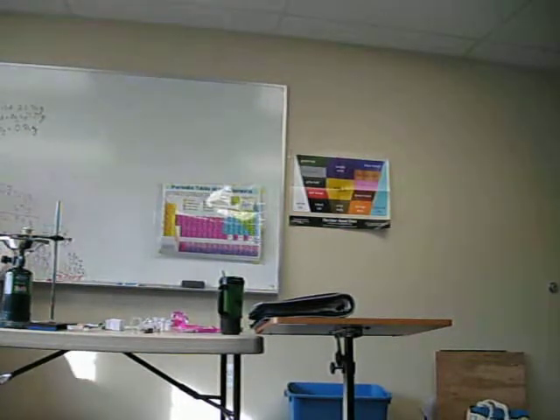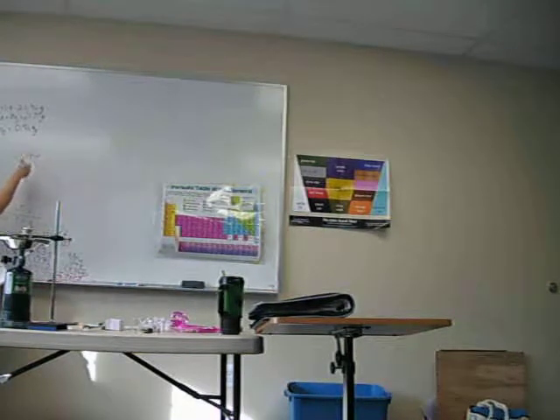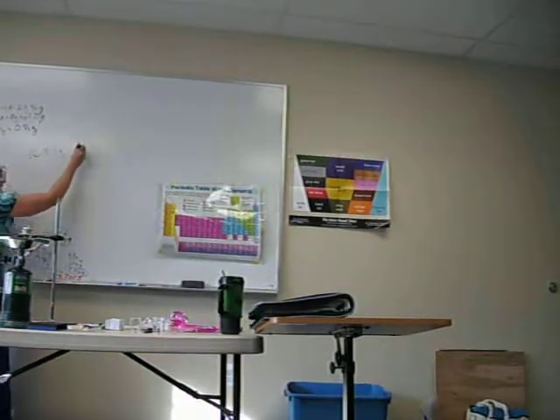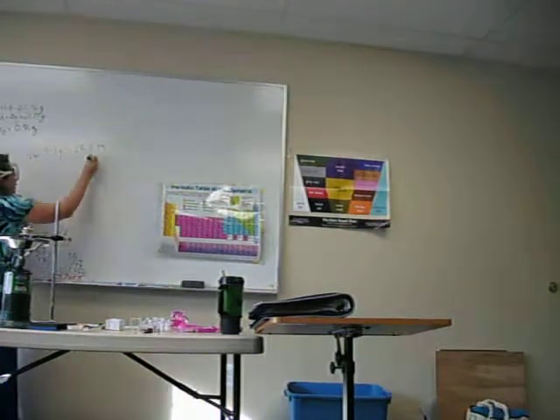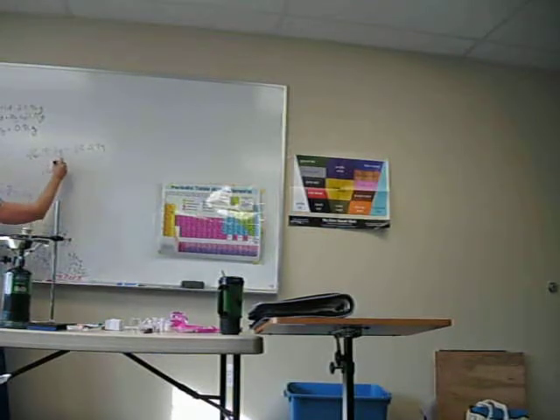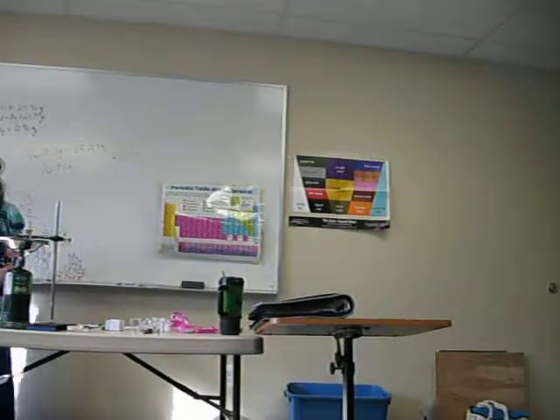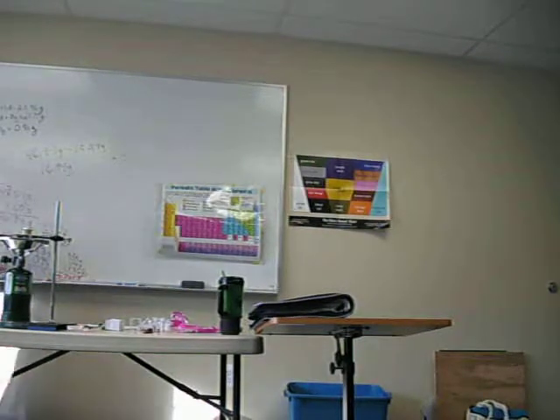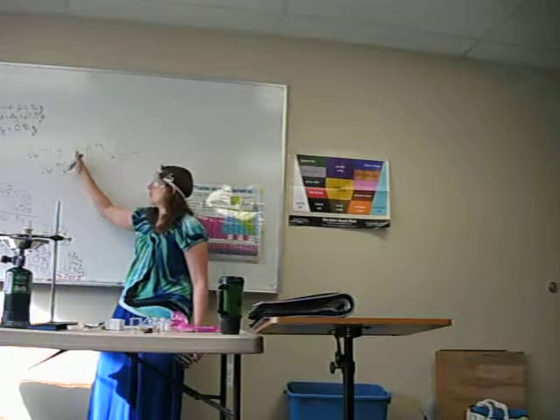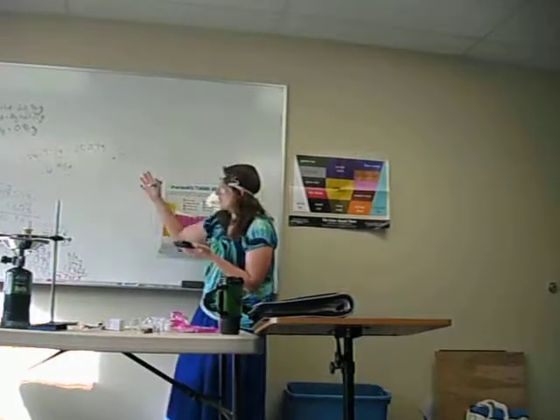For the sugar gum, the mass of the gum and the sweetener was 46.94 grams. Now we'll subtract the mass of the gum without the sweetener, which is 13.29 grams. And then we'll divide by the mass of the gum and sweetener, the original mass, 46.94 grams, and we multiply by 100%. Now this should look very familiar because it's our percent error equation, but it's also the way you find percent composition. This will be the percentage of sugar in the gum, because what we're doing here is taking the gum plus the sugar minus the gum without the sugar, so this should give us the mass of the sugar that dissolved away. When we do that, the significant figures are easy because we got to the hundredths place everywhere.